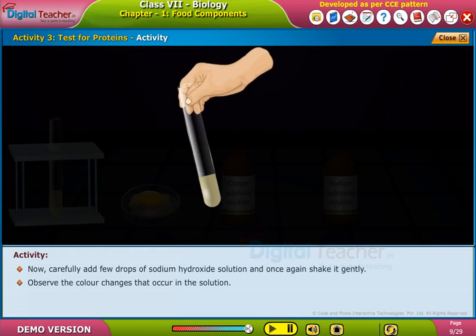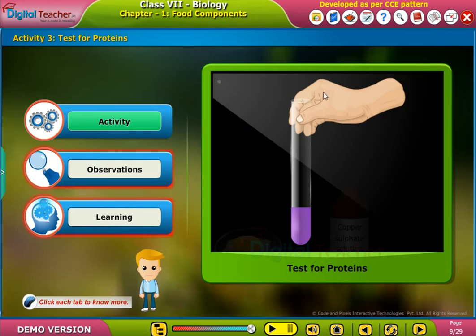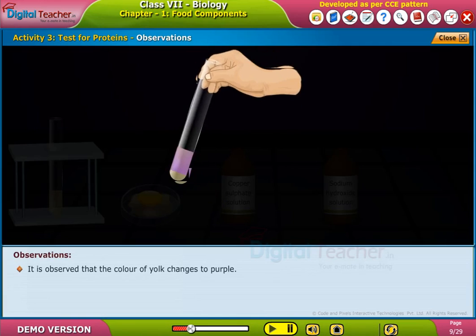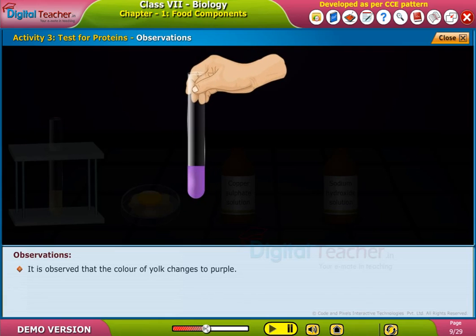Observe the colour changes that occur in the solution. It is observed that the colour of the yolk changes to purple. This indicates the presence of proteins.